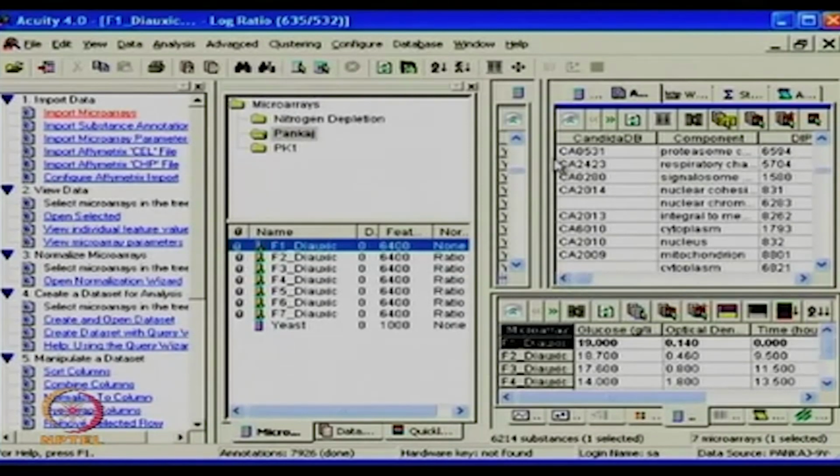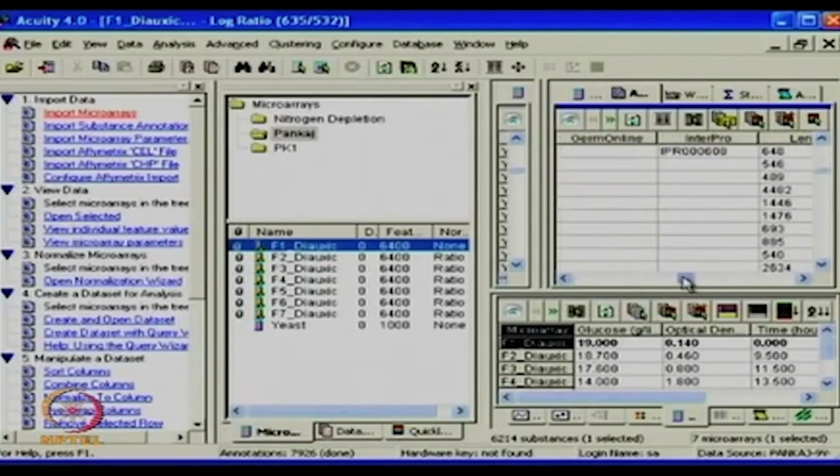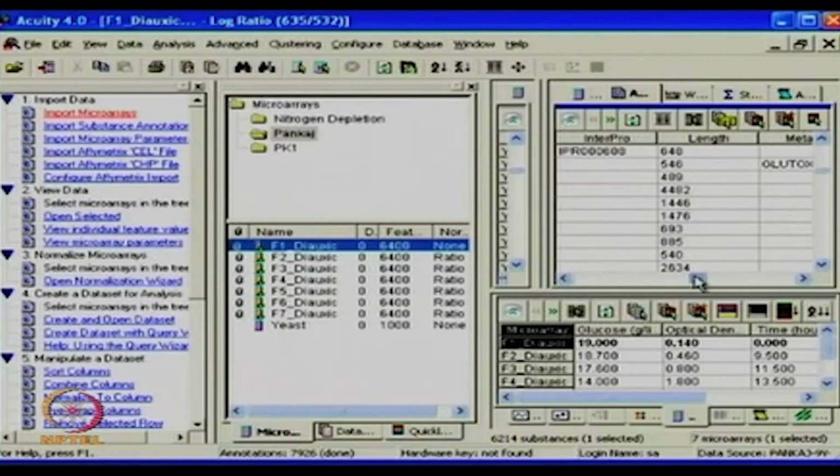You have the same annotation tab being given for the substance ID, and because each database of Candida is attached here, there are components and different functions, even at the level of enzyme commission numbers. There are different annotations which people try to get in, which you can also import in text delimited form, renamed to .sdt file, which allows one to take all the annotation information possible.